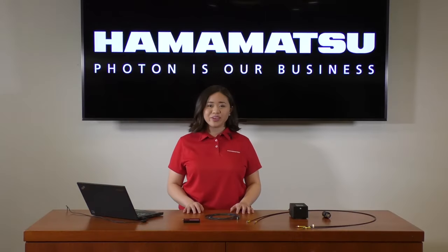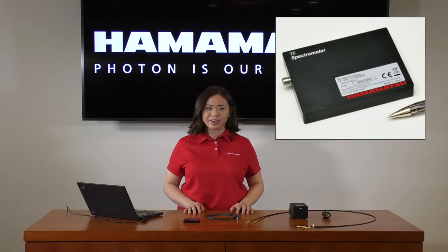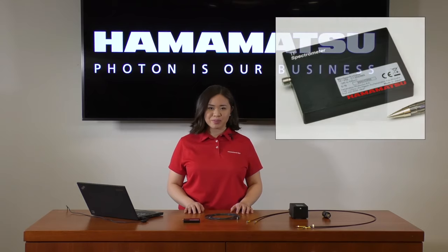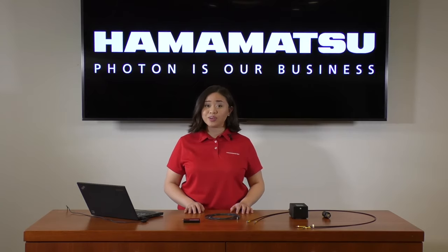Today we'll be testing the C13555MA thin-flat mini-spectrometer to calculate its signal-to-noise ratio, or SNR. SNR is important because it represents your level of measurement accuracy, so the higher your SNR, the more accurate your measurements.